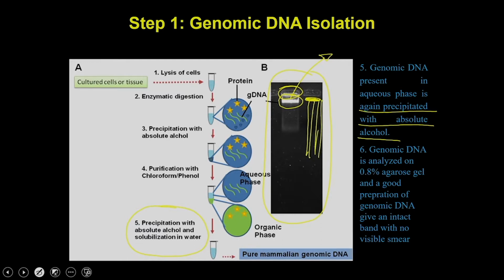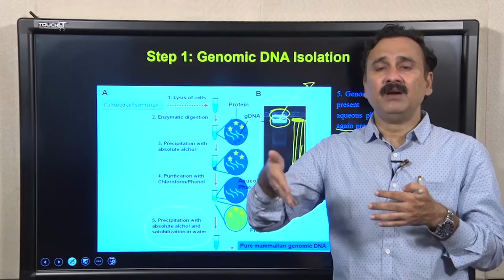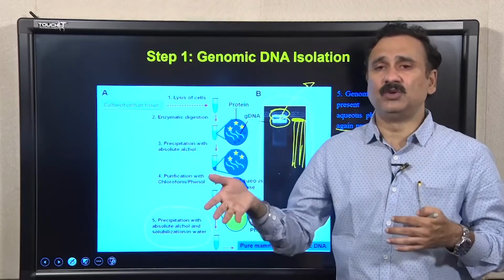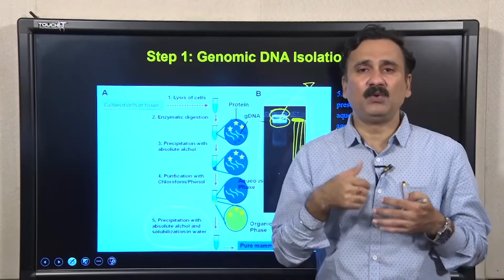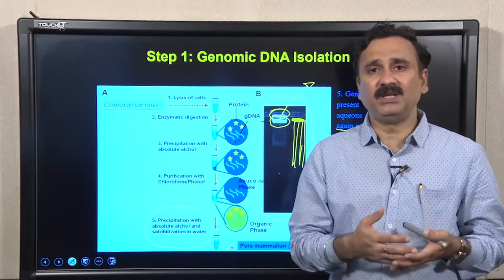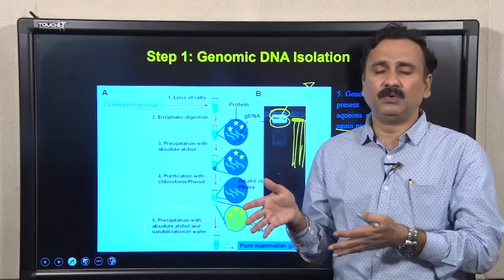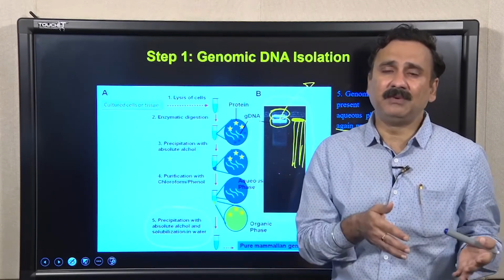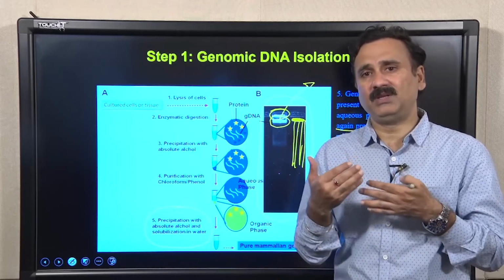That smear formation directly indicates that the genomic DNA prep you have isolated from the cell is not good, because you have fragmented or degraded genomic DNA, which means if you use this type of prep, you are going to lose some of the genes, or some information. As a result, if you do the Southern blotting, you may not see the signal, or it could show you some artifacts.